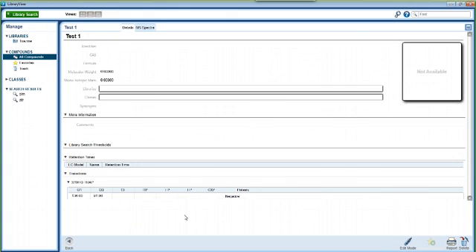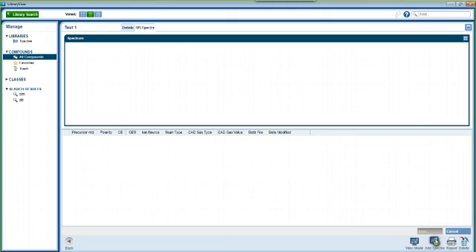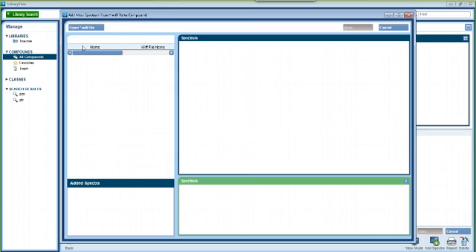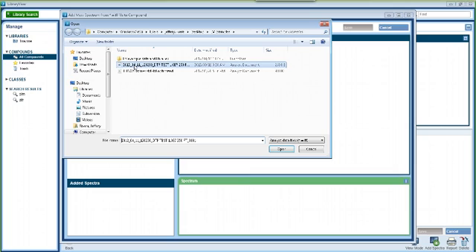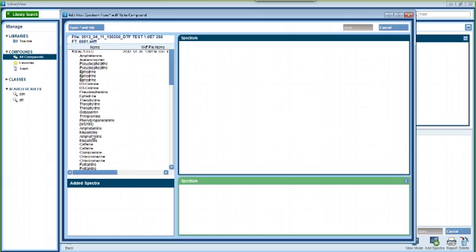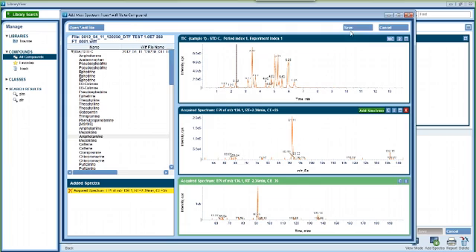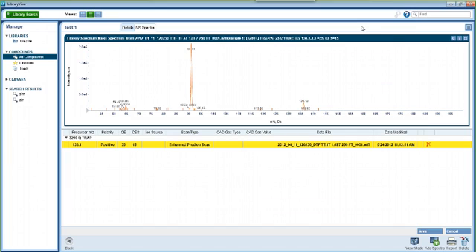Now we can add spectra to the compound. Click on the MS spectra tab and then click edit mode and then add spectra. The add spectra window will open and we can browse to the data file that contains the spectrum of interest. Click on the peak that contains the spectrum of interest and add the spectra to the list. You can now save the spectra to the new compound you've added.